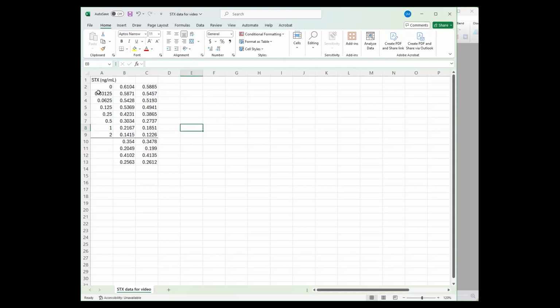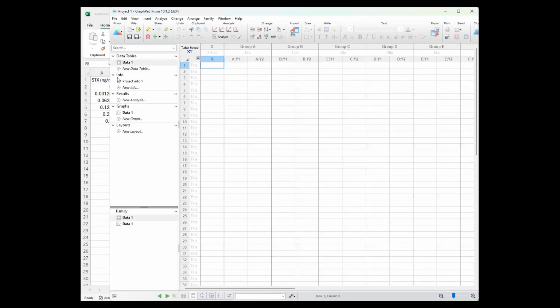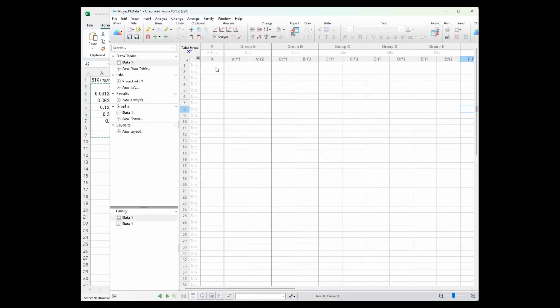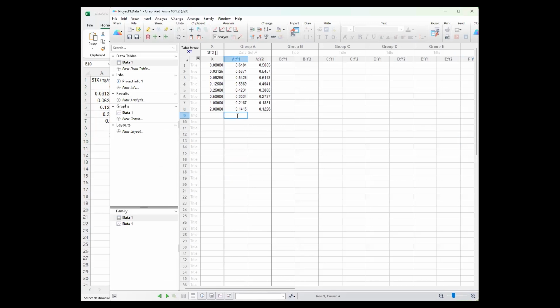All right, now the easiest way to do this is if you have a program like GraphPad. GraphPad Prism is fabulous. It calculates your values for you, runs your standard curve. So let's start with that. You open the program, you'll have to select Y. We have all of our data in duplicate, so we have 2 replicates side by side. Create a spreadsheet. Then we're going to grab our standard curve and put it in here. Label this Saxitoxin concentration.